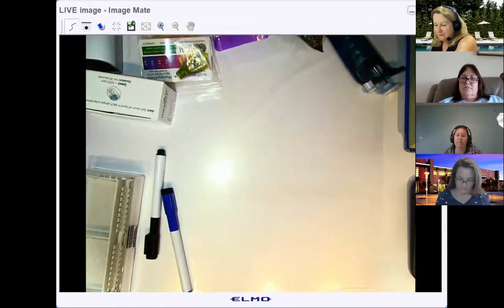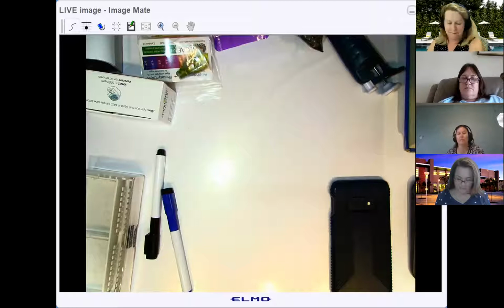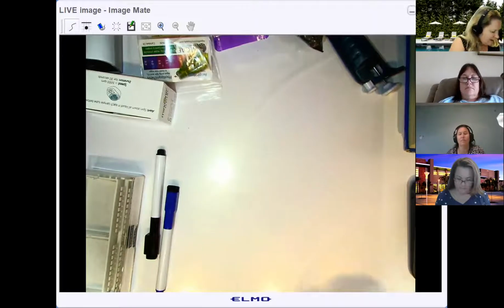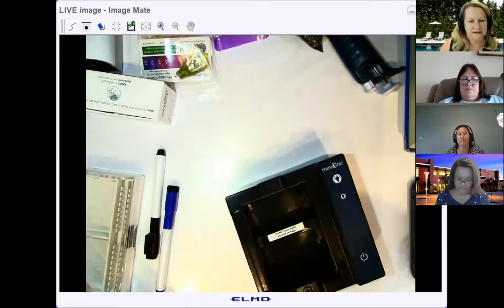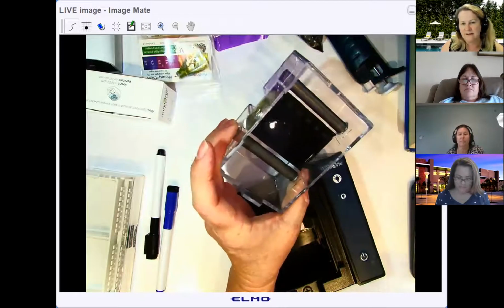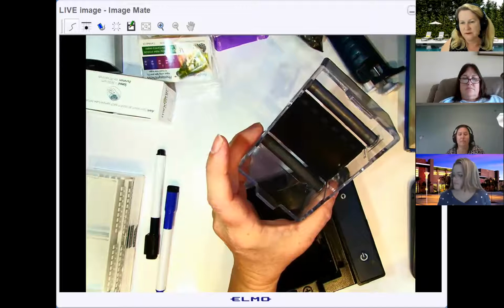I used the BioRad gel boxes for years, and I love the BioRad gel boxes. I think they're really good quality. I think when your students go off to college, they are probably likely to use the BioRad gel boxes because they're used in industry as well. But the reason I switched to these MiniOnes is for a couple of reasons. You'll see it as we go through it. When you run the gel, instead of having a skinny platinum wire like most gel boxes do, they have this big old steel rod, which is virtually unbreakable.